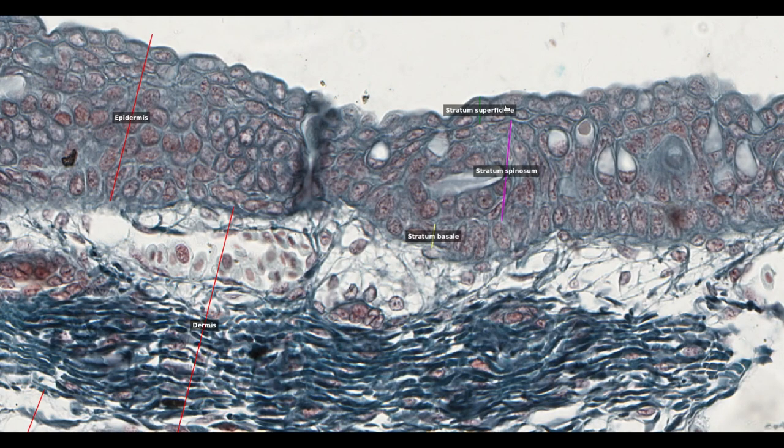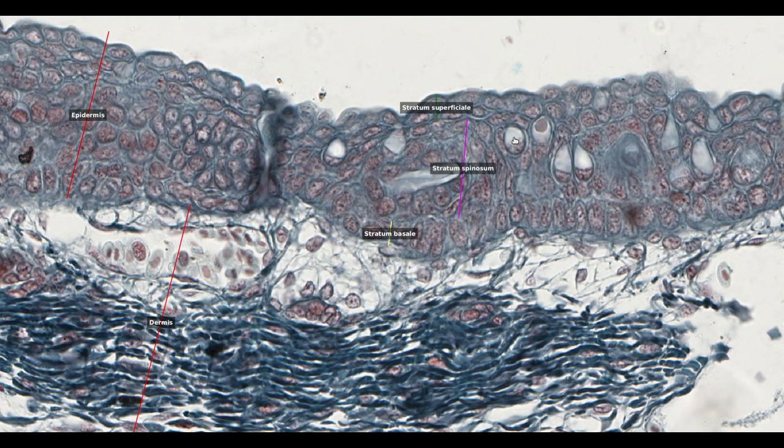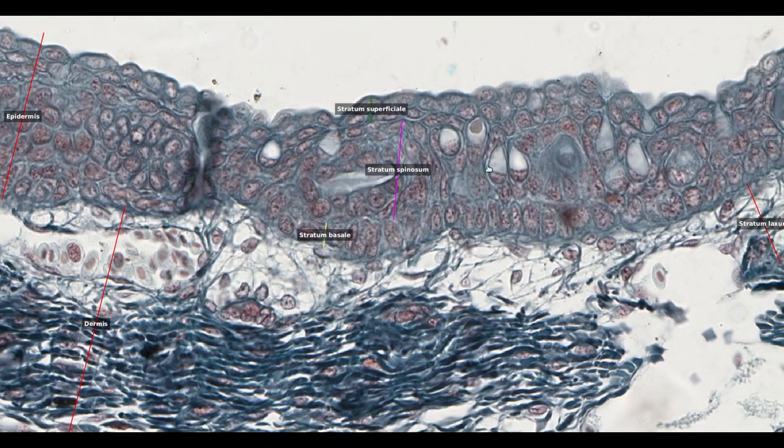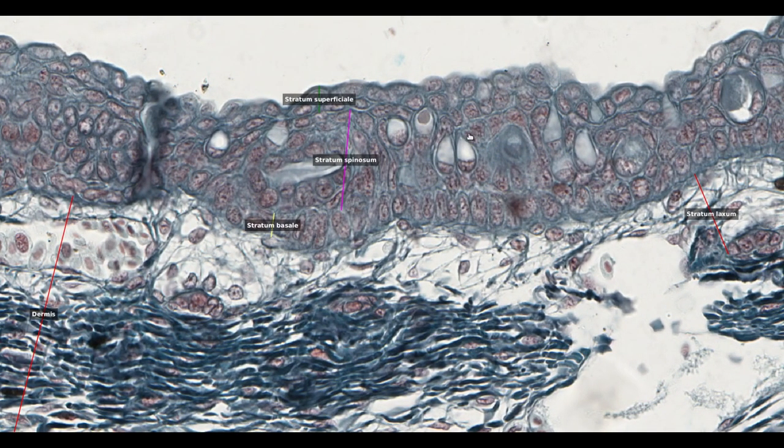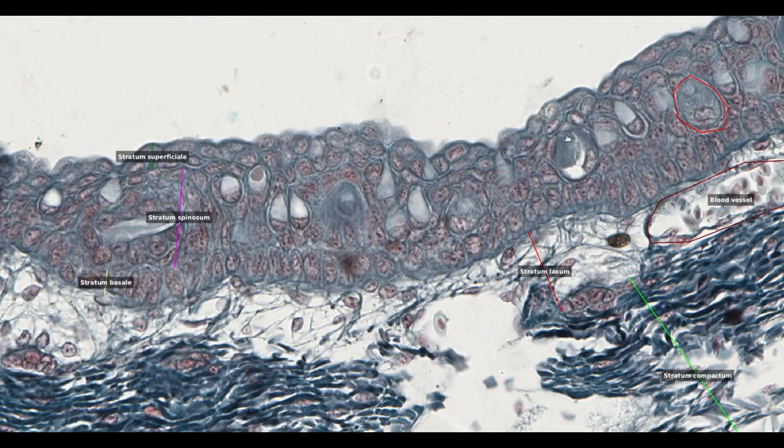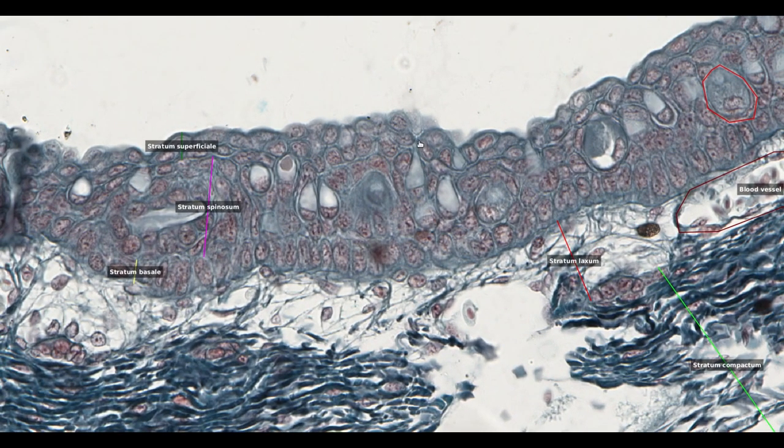Although most of the cells here are epidermal cells, there are a few other cell types mixed in. For example, free nerve fibers will reach the stratum superficiali providing sensory input for the skin, although we can't see them in these sections. You'll notice that there are large numbers of secretory cells amongst the structural epidermal cells. Some of them are quite large and you can appreciate, for example here, that they're filled with mucus which is squashing the nucleus against the cell membrane. In this section, you can even see some of the secretory cells extending to empty their contents onto the stratum superficiali like this one here.